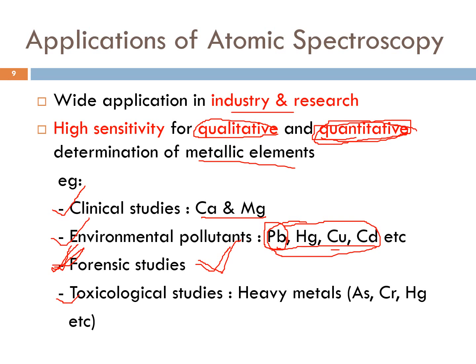So for toxicological study, you nak tahu the toxicity of that, contohnya plant lah. You have found a plant, tumbuhan yang boleh cure certain disease or boleh as antioxidant, for example. You dah proven its efficiency lah. So sekarang you nak tahu dalam plant tu ada tak heavy metal. Contohnya chromium, mercury ke apa semua kan. So you nak tahu, you boleh guna juga AAS. Kemungkinan dalam plant tu ada juga heavy metal, dia absorb melalui soil ke apa semua. So this AAS is very useful to determine the metal inside your sample lah.